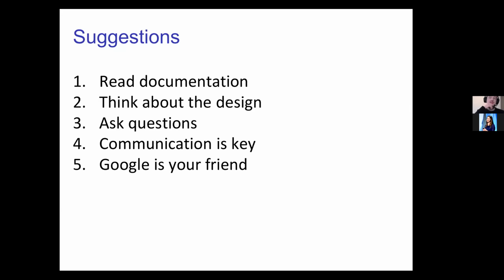Communication is key, and by this I mean, if you're a person like me, who mainly just analyzes data, then it's important to talk to the lab technicians who have prepared the libraries and sequenced the samples.